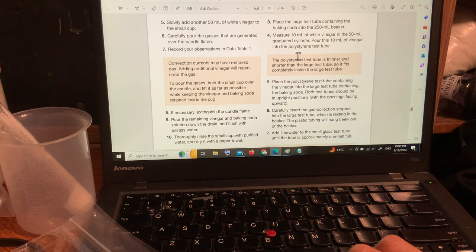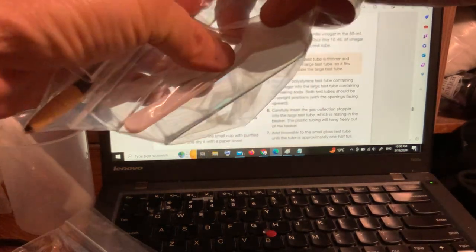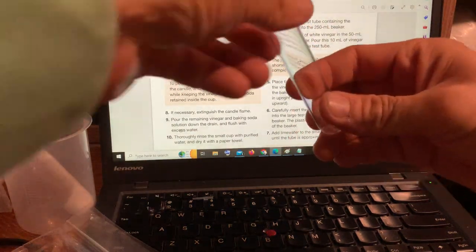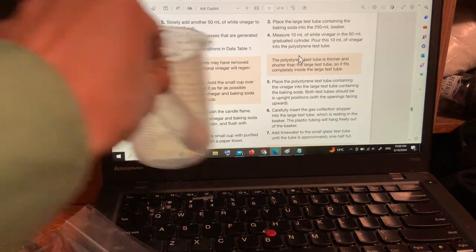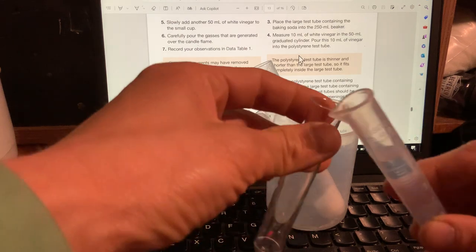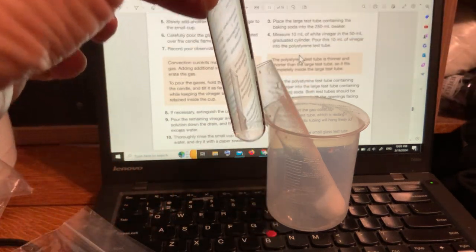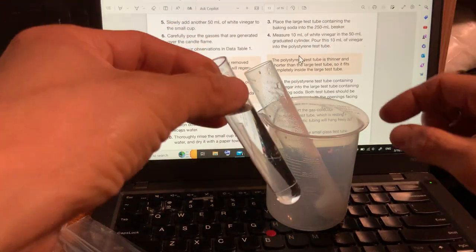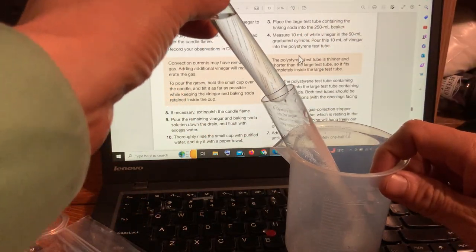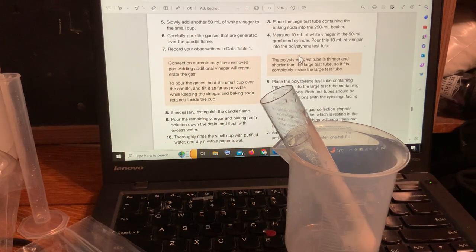Oh, hang on. Polystyrene tube. Oh, I'm sorry. I skipped a step. They want me to use a plastic test tube. They do not want the vinegar to be in here directly. They want the vinegar to be in here first. Polystyrene test tube means plastic test tube. Want it in here, and then they want this in here. There it is. The polystyrene test tube is in there with the baking soda.